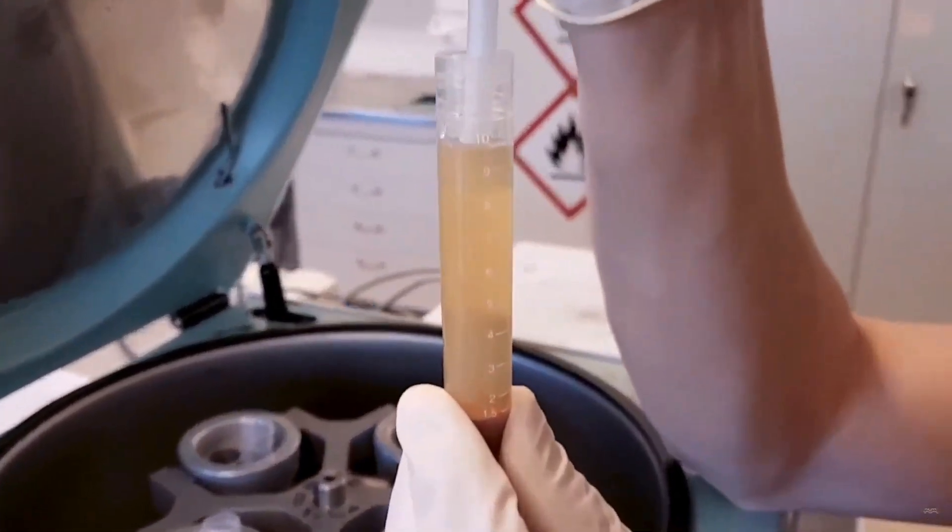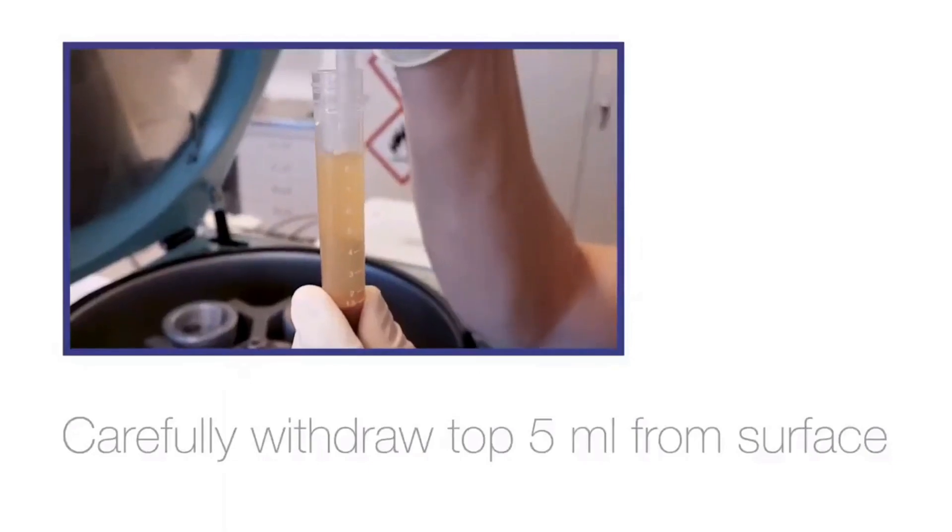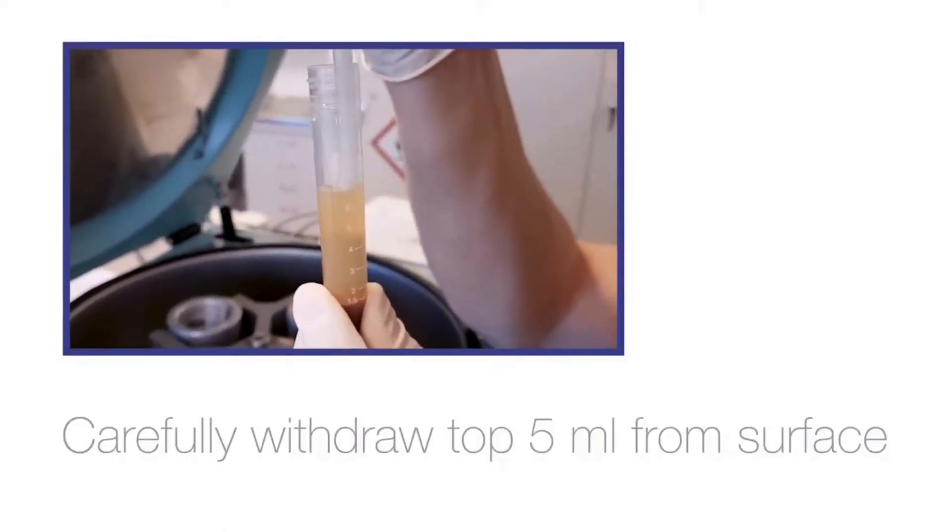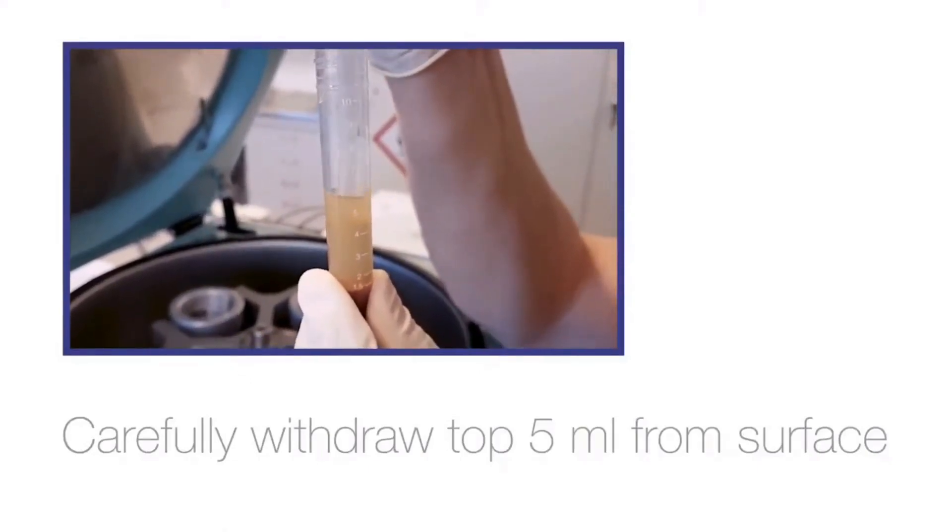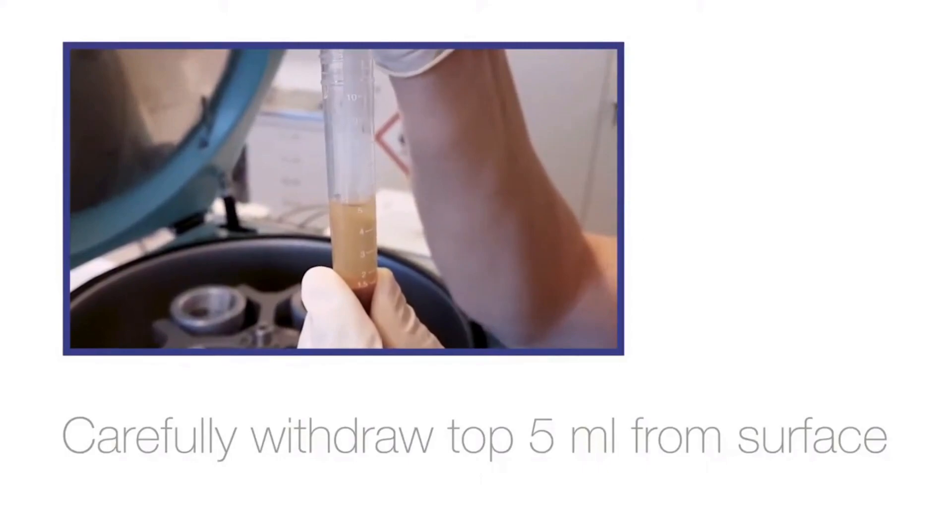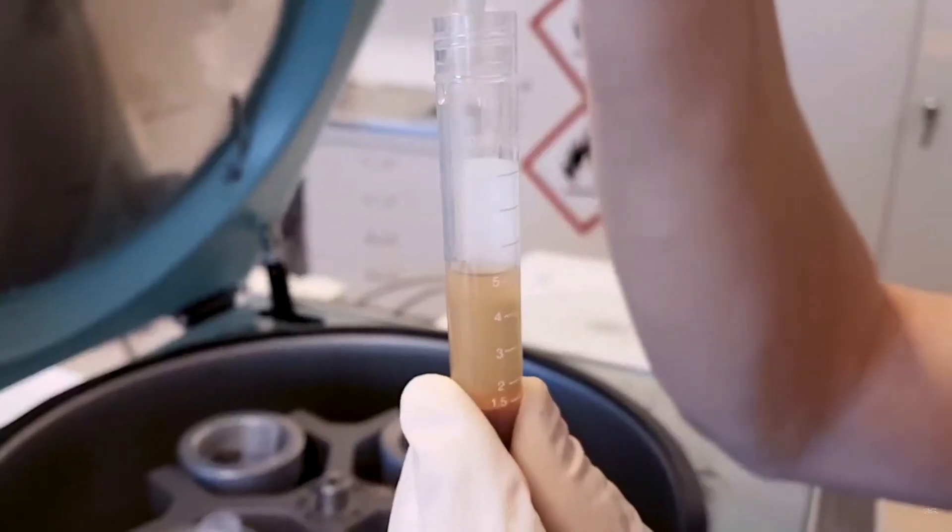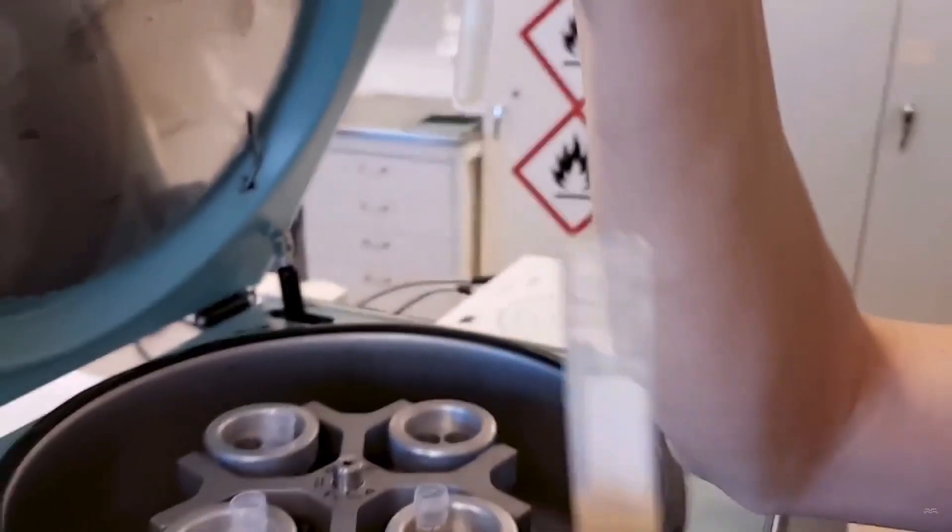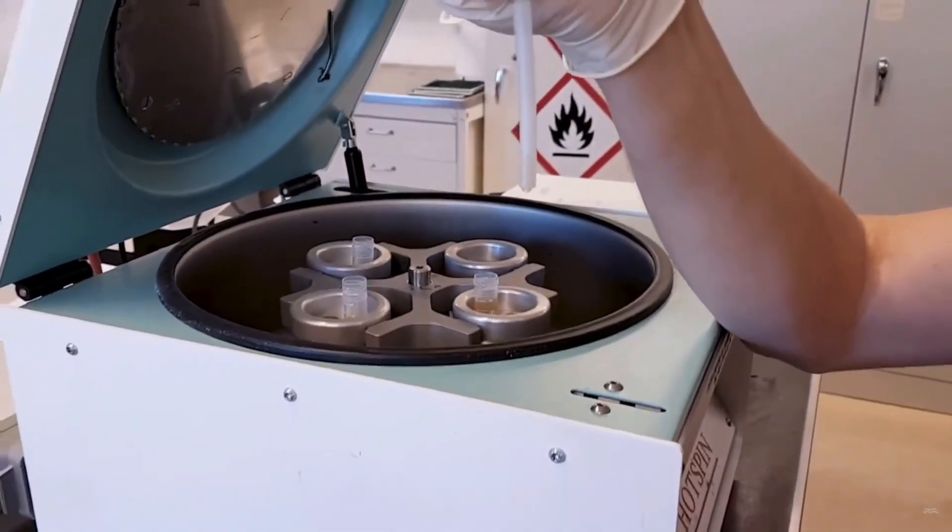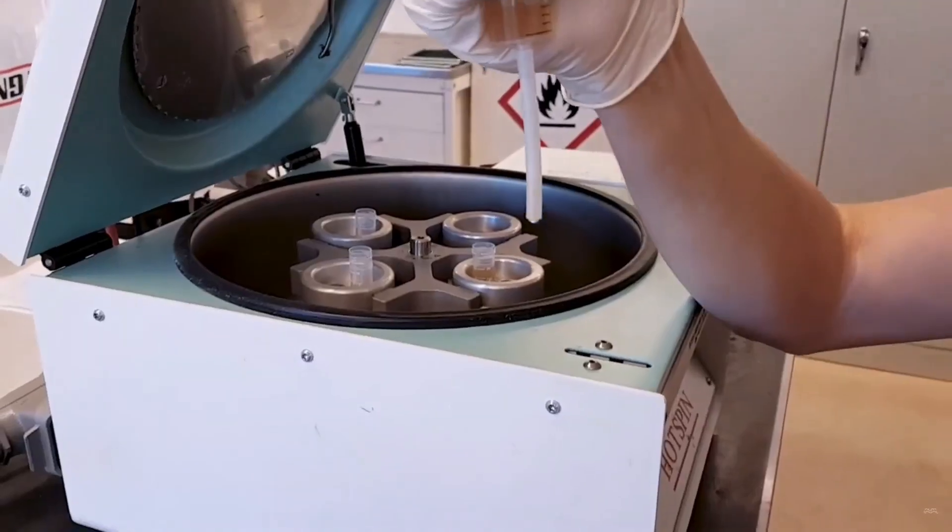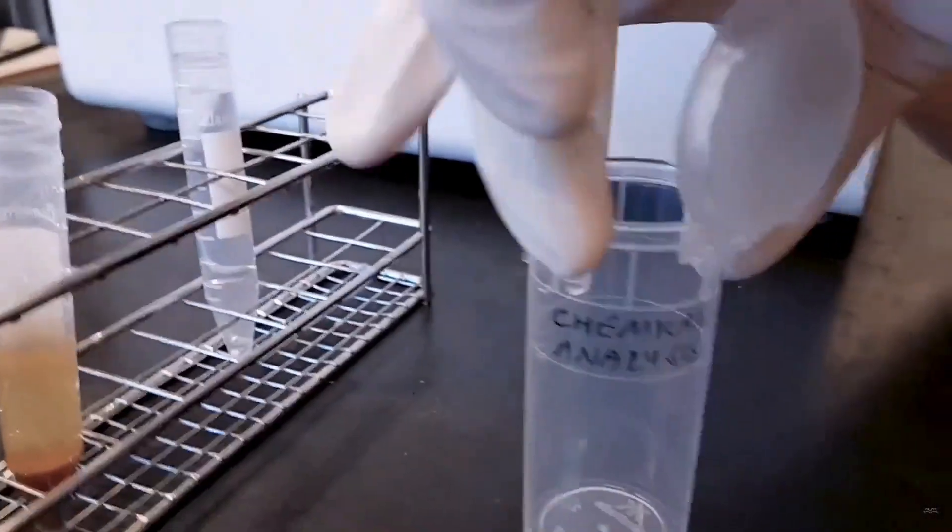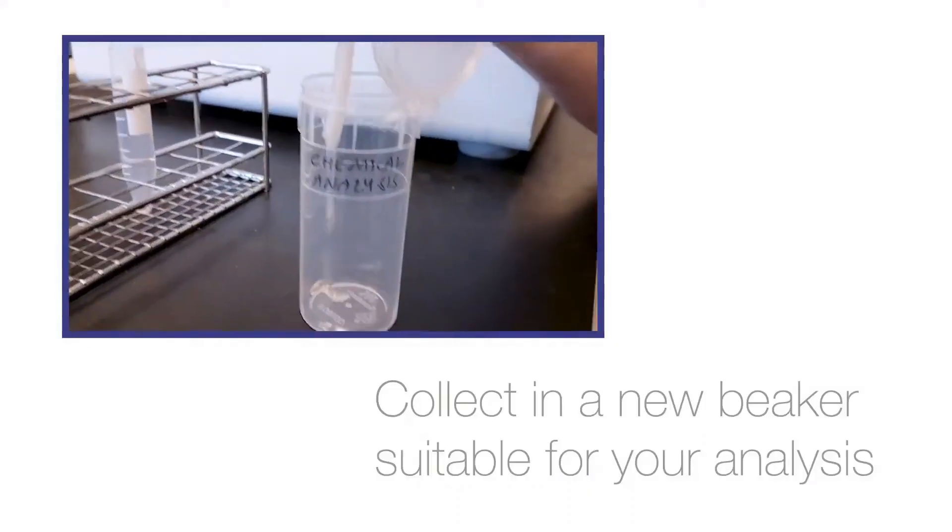You will then sample 5 milliliters from the first vial. These should be taken as close as possible to the liquid surface so you need to lower the syringe while you sample. A small beaker will be used to collect the substrate.